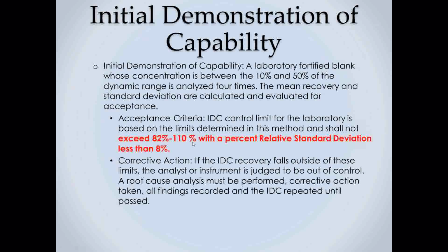So we took the limits that were developed in this method, initial precision and recovery, put it in this method, and in some cases, if it was reviewed by Len and Kevin, and we say, look, we'd like to have it just a bit tighter, we looked at things, we said, yes, that's reasonable.